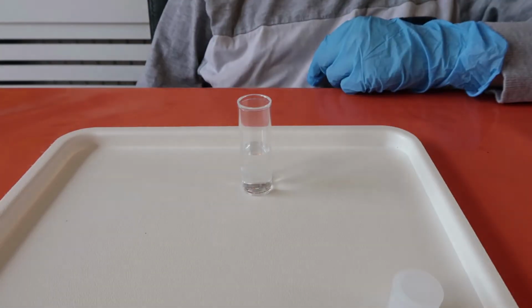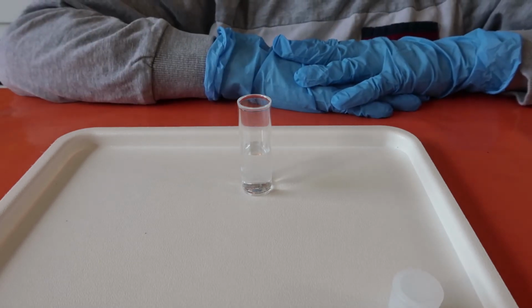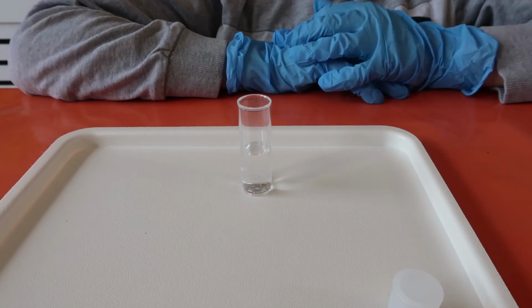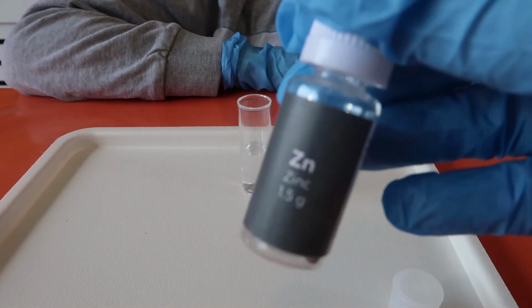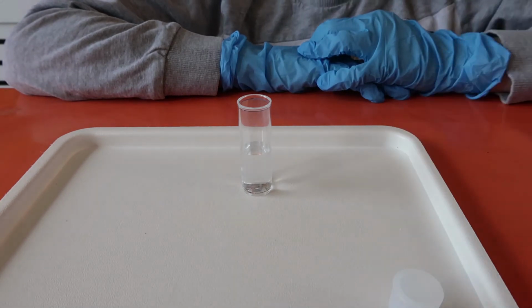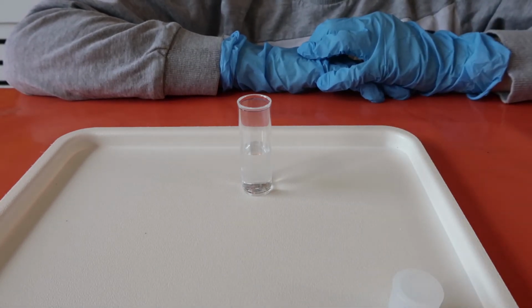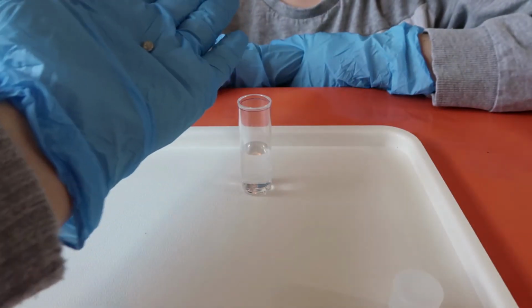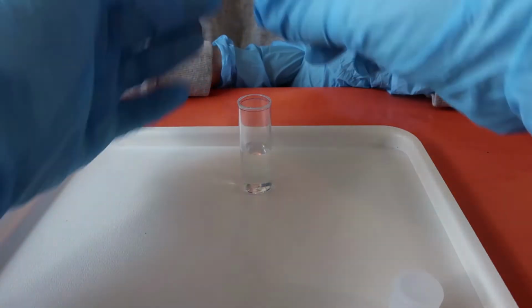Right, so now we've filled that up halfway, then we need to take a piece of zinc. Where's our zinc? So here we've got some zinc. Okay. So a tiny bit. So the code for zinc is Zn. Okay. So we're going to take one piece of zinc. So we have a piece of zinc and we're going to pop it into the solution.